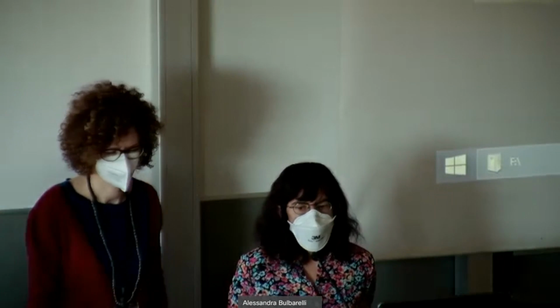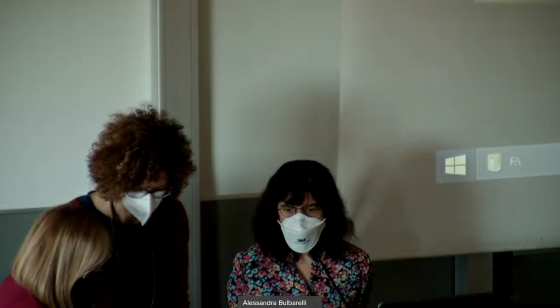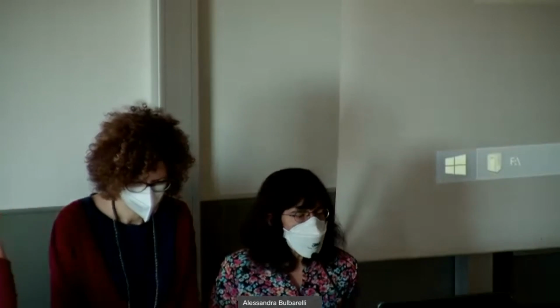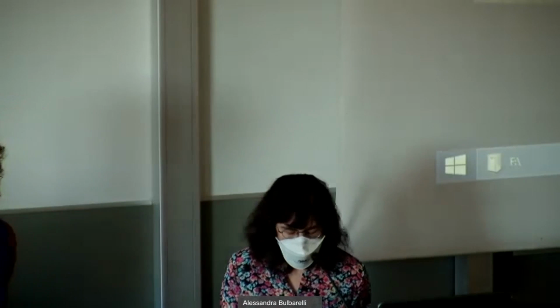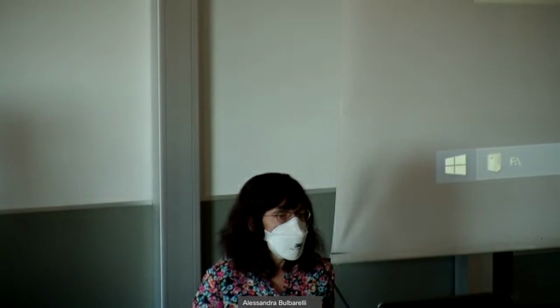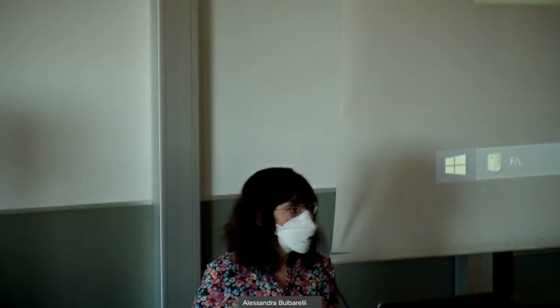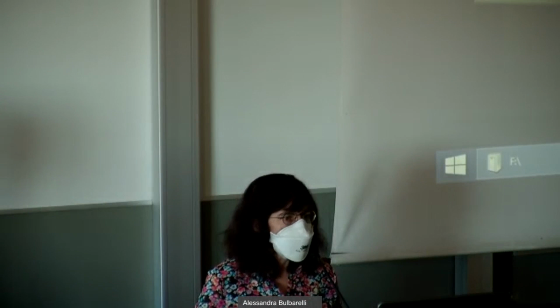Have you tried to modify the two sets and see how stable, how robust the results are? Yeah, for that, we do it randomly, and actually we do it 6 times randomly, dividing the data in 6 groups, and always getting 4 as training set and 2 as test set.